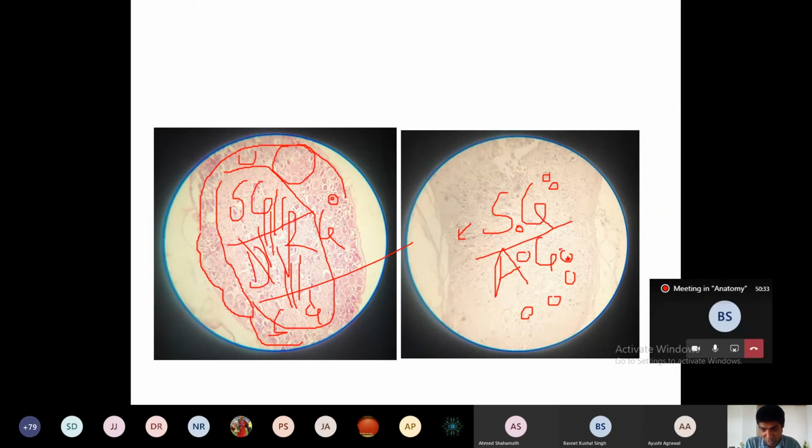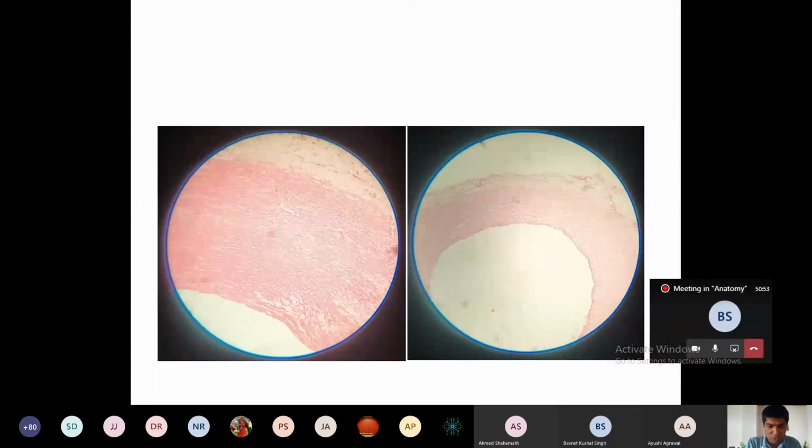And even you can say satellite cells are there circling. Satellite cells will be there in both places, in the DRG also, and even in the sympathetic ganglion also. This thing you can write. This is lying there in the sympathetic chain, or in some autonomic plexuses. You can write the distribution.